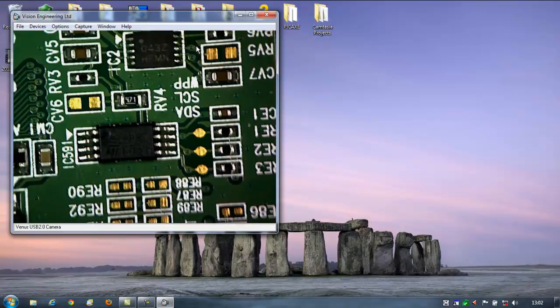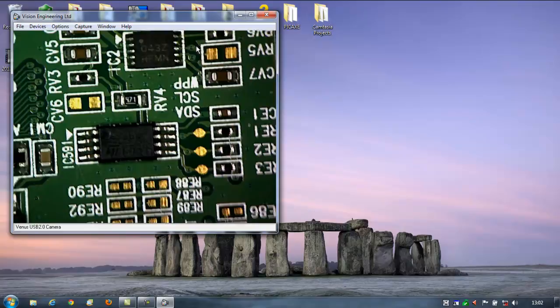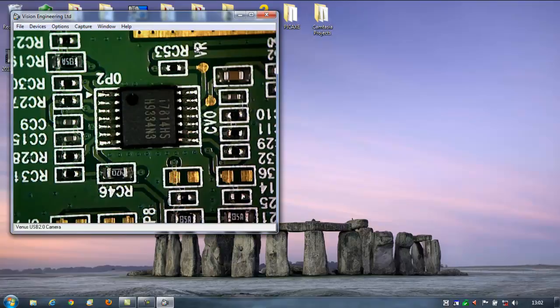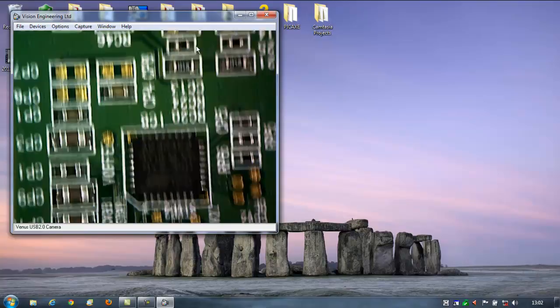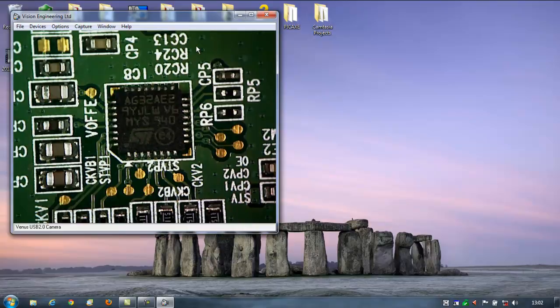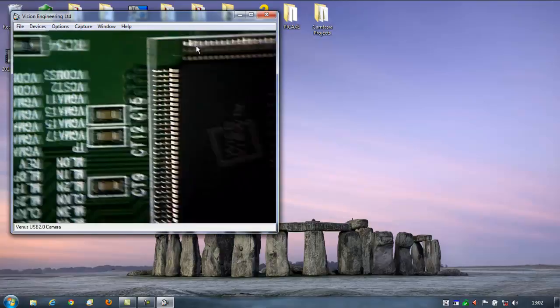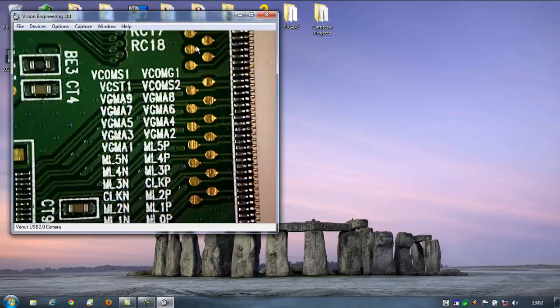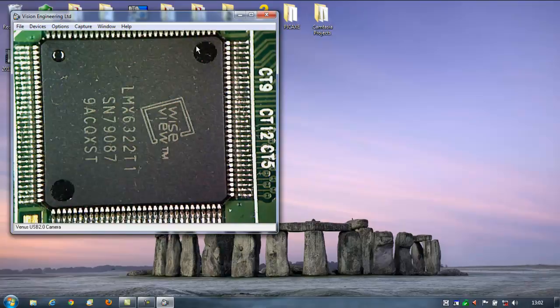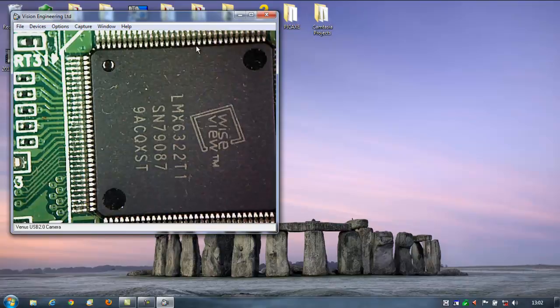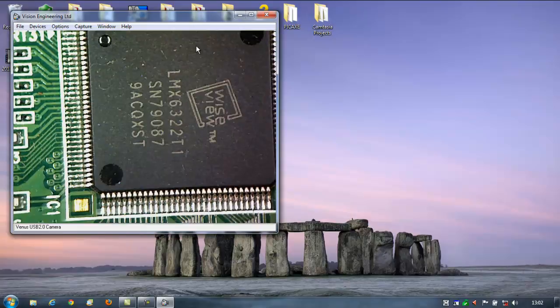Look, all these settings are making it nicer for me to look at. I still don't think it's going to make any difference if I pop that to full screen size. It's just not able, OK. You probably could use it like that. But it's obviously much, much better back down at that size. Let's move over to a smaller chip. There we go. Yeah, OK. Now I'm pleased. That's a much better picture. Some tweaking and adjusting of the lights. I'm sure we can get that set up very nicely. Perfect for the forum videos anyway, which is really what it's going to be used for. I'm sure I'll just use the screen on the Mantis itself to do whatever work I want to do.